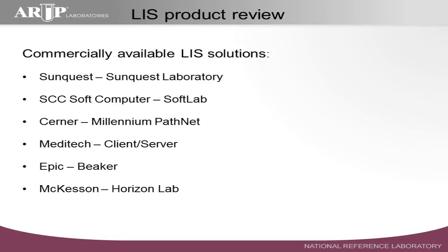And some of those lab systems in the different healthcare systems get replaced from time to time. And typically they're being replaced by the Beaker system from Epic. And you could see why that happens from a business perspective. Epic has a very large footprint out there in healthcare, and all they have to do is go into the IT leadership and the clinical leadership and say, hey, we're doing everything else for you. Why don't you just replace that lab system with our lab system? And that helps them from a revenue side and gives them a bigger footprint in that particular healthcare system. So that system is really gaining some traction.